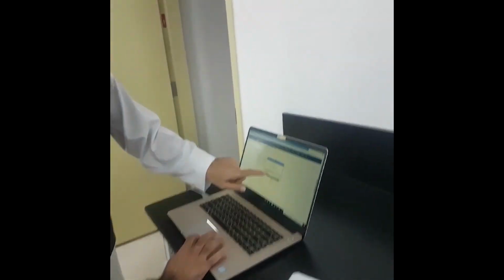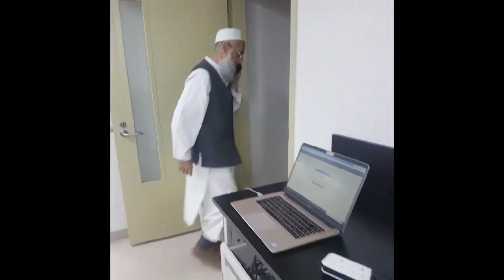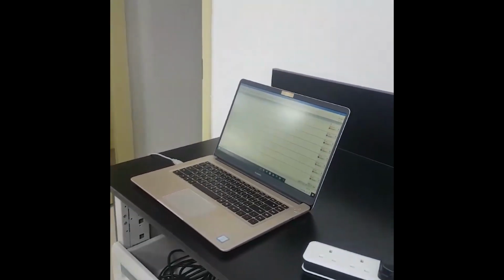None found. These scan devices. So just let me see whether it is on or not. All right. So we have connected your laptop with the data acquisition system, that is PowerLab.